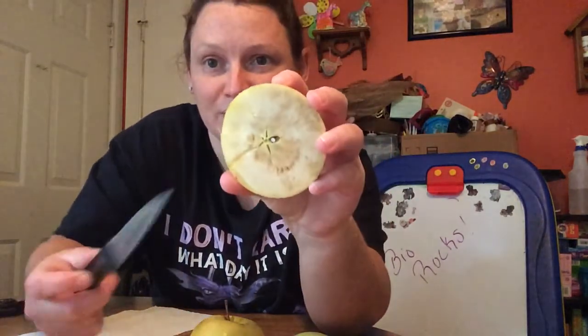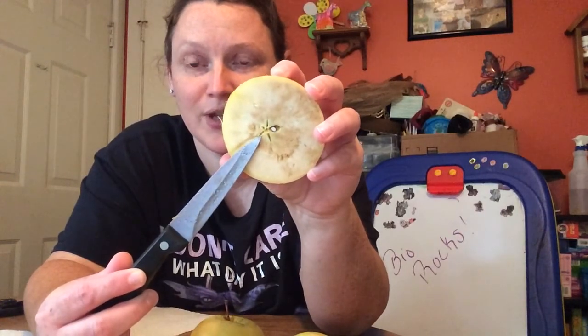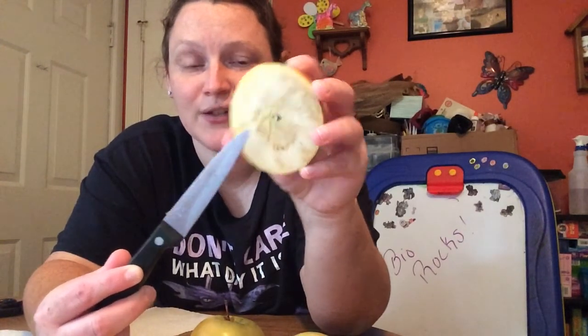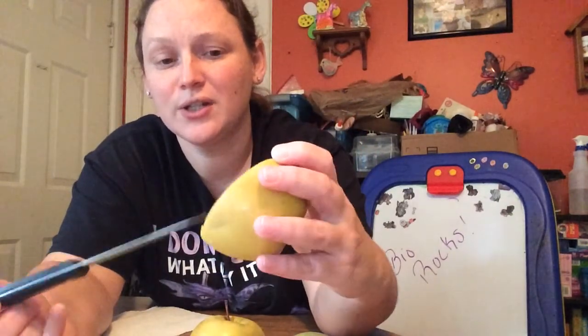For the second apple, I'm going to cut it slightly differently. Okay, so cutting it this direction. So this allows me to see the organization of the seeds in here. I apologize, my apple is a little overly ripe. Okay. So in apples, the seeds are actually arranged sort of in a star pattern. So these used to be the ovules. Okay, the tough integument part is becoming the outer seed coat.